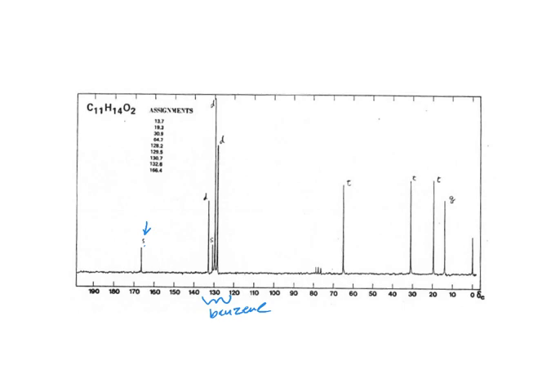Right? So a singlet means it has no protons attached. A doublet means it has one proton attached. Those are written on there. So this is a T, if you can read it. Means triplet, right? So that means that this has two hydrogens attached. It's a CH2. Quartet means it has three hydrogens attached. So we're just seeing the couplings from one-bond proton-carbon couplings, N+1.